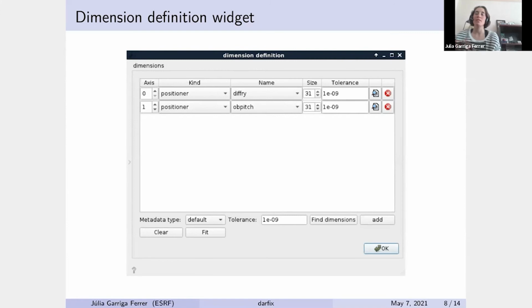I don't know if it's the same as what I will tell now, but we are working on adding 3-dimensional motors. So adding more motors is possible. The idea is to be able to do the analysis with more than 2 motors, and also with 1 motor is possible. But if the step size is okay with the whole data set, then it shouldn't be a problem. But maybe we should add an intermediate step to link those motors for the maps.